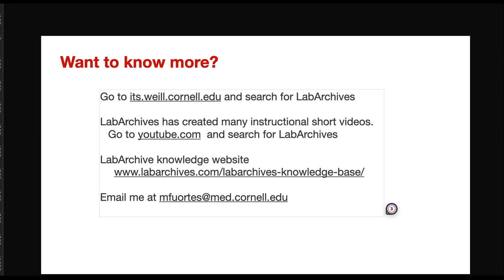Yeah, absolutely. I agree 100%. You can use Excel as long as you store the files in LabArchives. Excel as a computing tool is perfectly fine. The problem is where you store the data. So as Tom said, keep the data in RedCap. If you want to do any elaboration, and remember that LabArchives is good for PHI, you can do whatever you want in your Excel spreadsheet, and then upload it in LabArchives. So all your data is either in RedCap or in LabArchives, and it's perfectly safe.